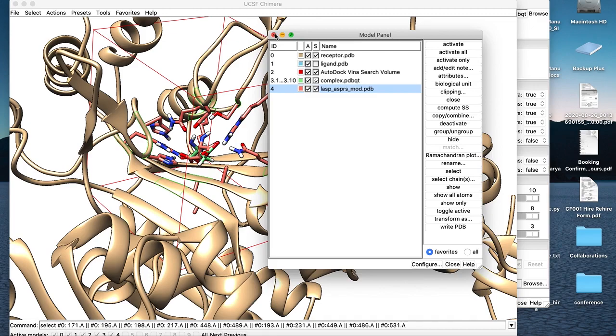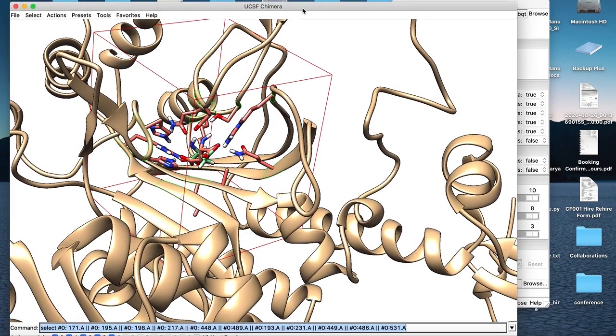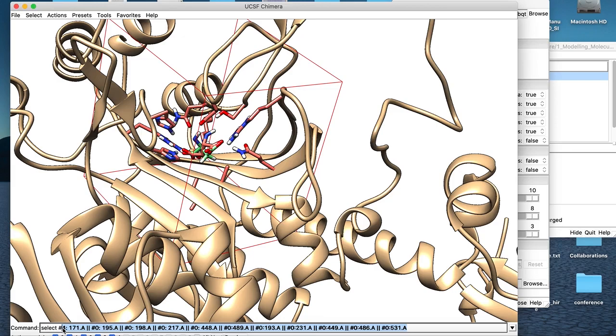So we're just going to change the model number here for the selection from model 0 to model 4. We can just select all of the residues of model 4 such that the licorice representation will be gone, whereas the ribbon representation will still be there. So let's go ahead and just delete this part altogether and just have all.a.